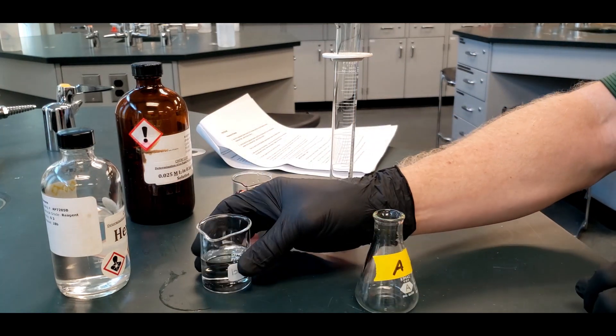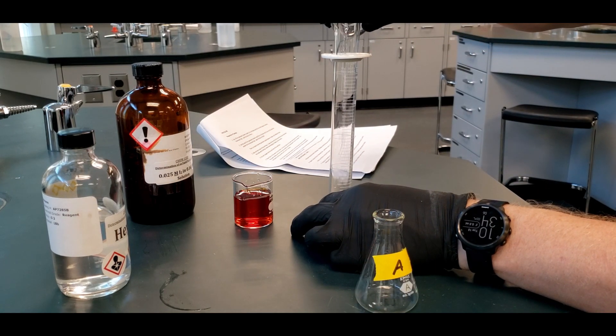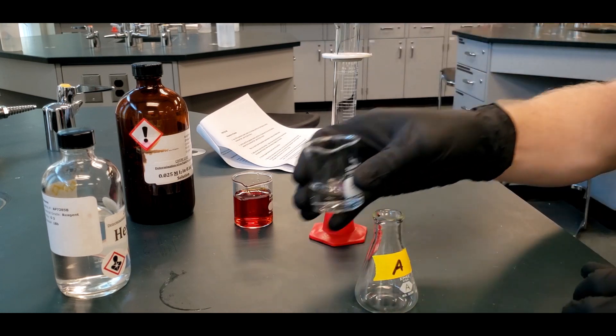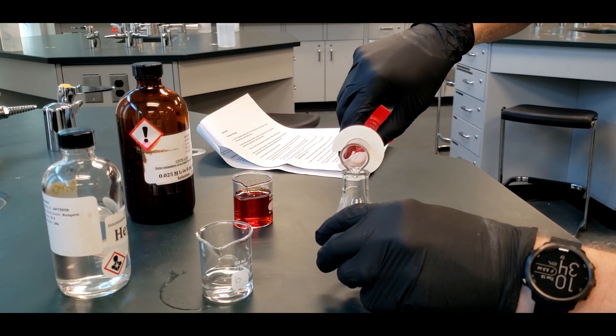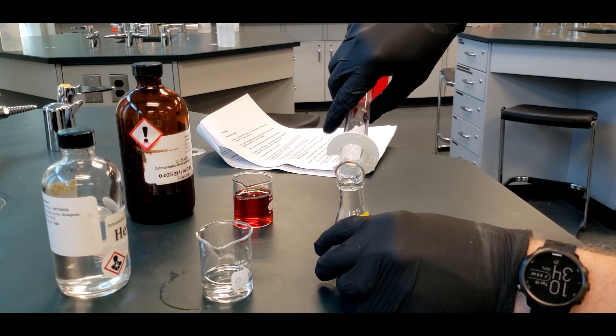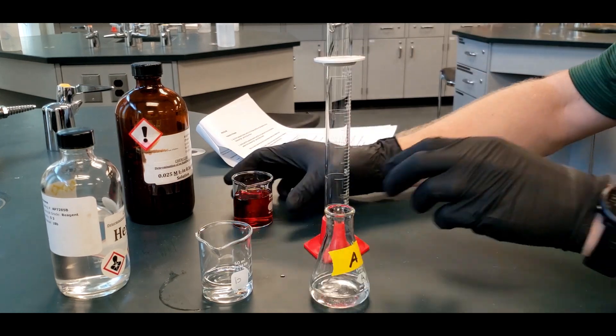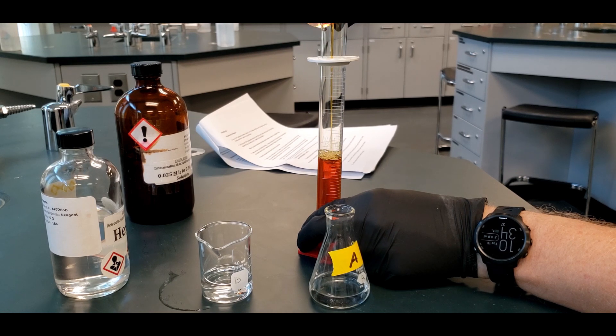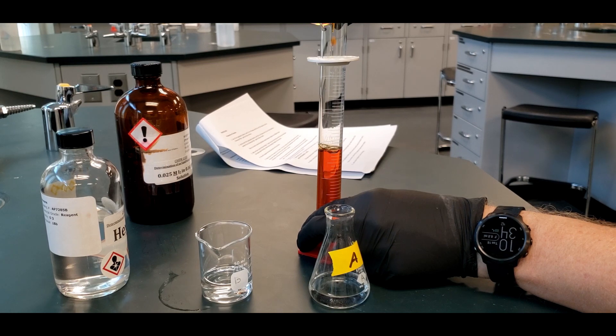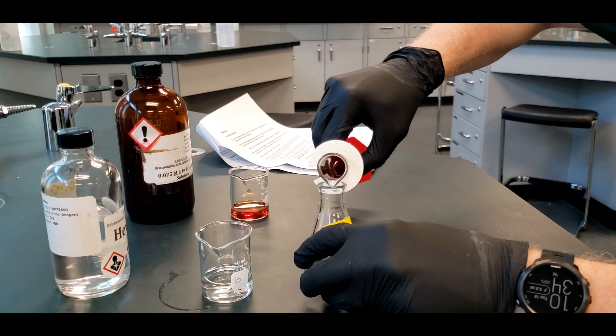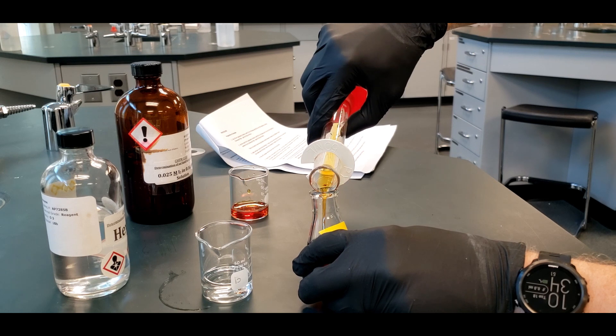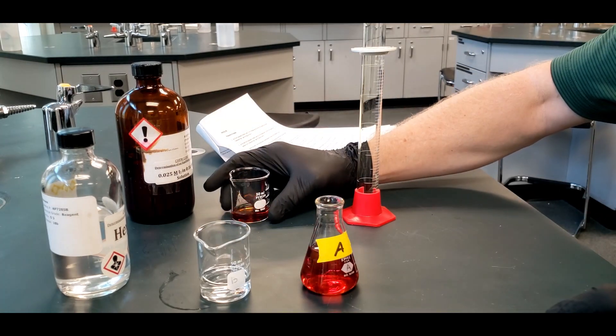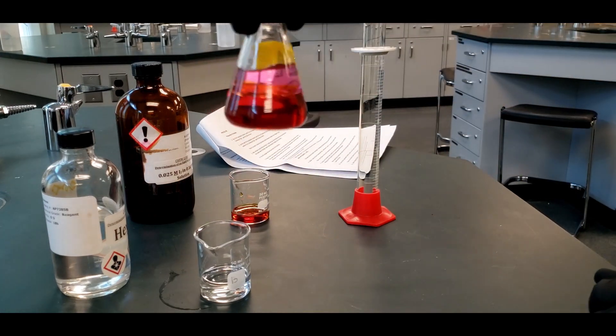Alright, so we need 15 mL of hexane. That goes in here. And then we need 30 mL of the iodine, potassium iodide solution. You should see this is hexane, so that's non-polar, and this is an aqueous solution. So there is going to be a layer. You can see that.